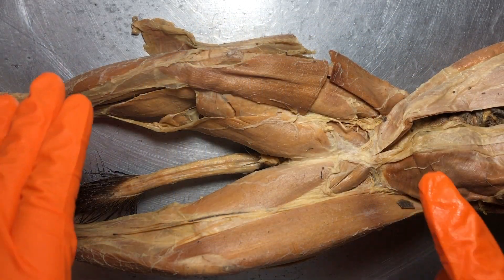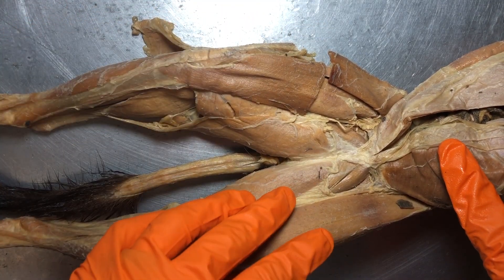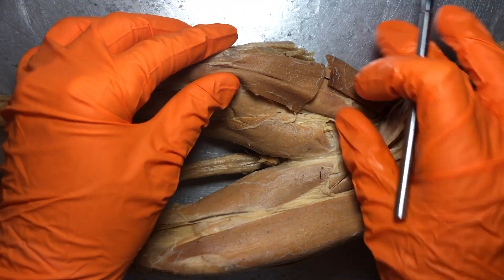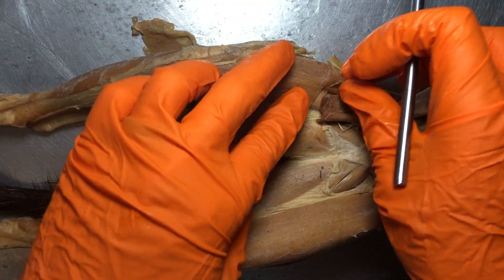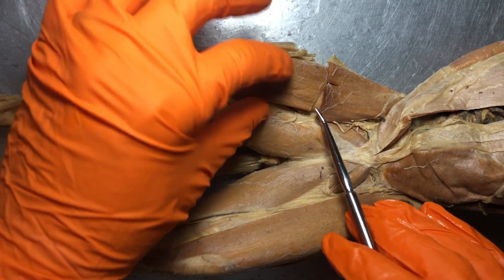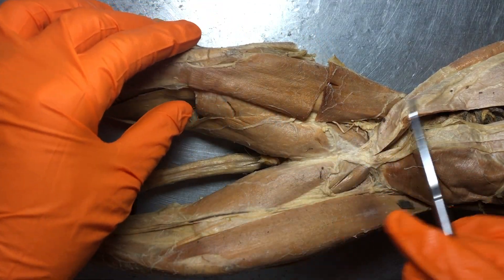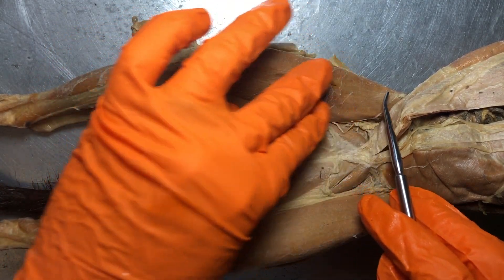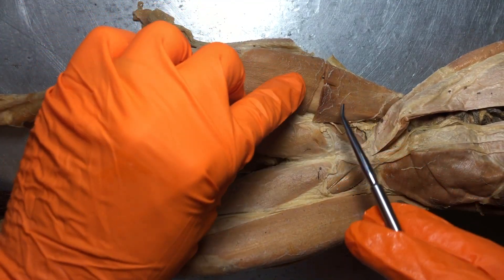Let's dive into the lower extremities — the right leg and the left leg on our cat specimen. The first muscle I want to show is this one that we've actually cut. This is the sartorius. You'll notice on the kitty it's actually much wider and takes up more space on the leg than it does in humans. This kind of flat muscle is more on the medial side — that is the sartorius.